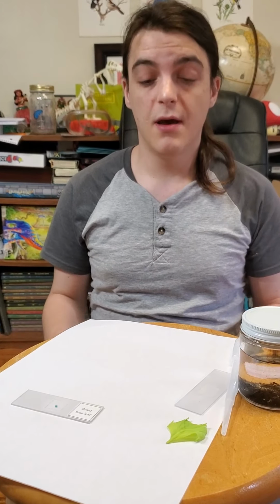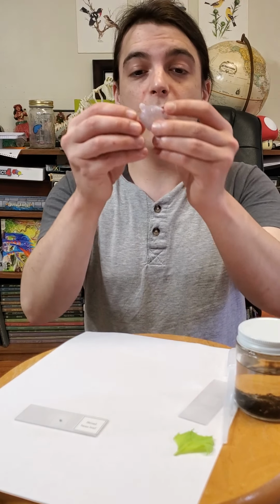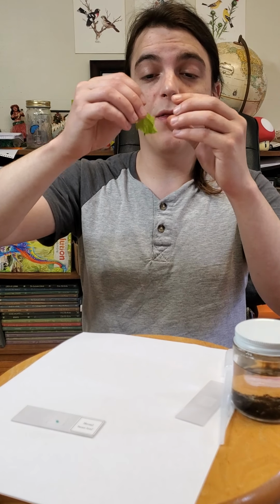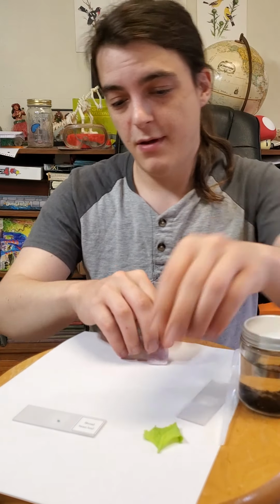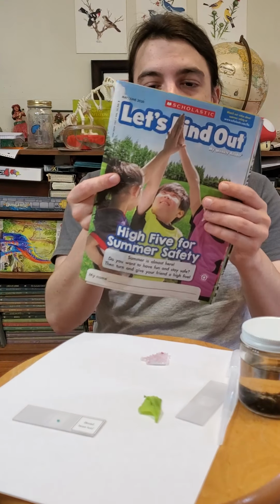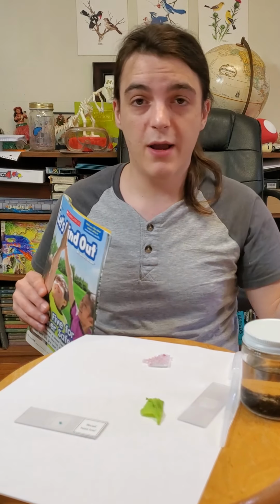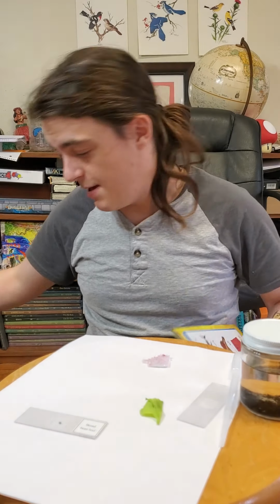For this week, I also want to give you a challenge, because I'm going to have you guys write notes on this. What I want you guys to do is we have 5 different items that we're going to look at under the microscope. For each of those items, I want you to show me how each one looks different on our scale, what you might call the macro scale. We got 1, 2, 3, 4, 5. I want you to tell me what these look like on the macro scale. Draw a picture of how they look different between the micro scale and the macro scale. The micro scale is going to be by the microscope. The macro scale is going to be what we see.